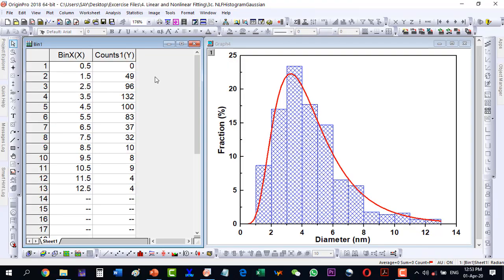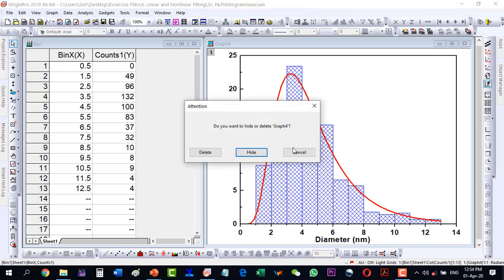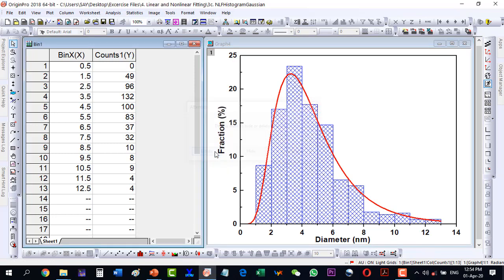In this video we will try to fit a histogram with a Gaussian function. This is the histogram and this is the Gaussian fitting of this histogram. So in order to do this, let's first go to the data.